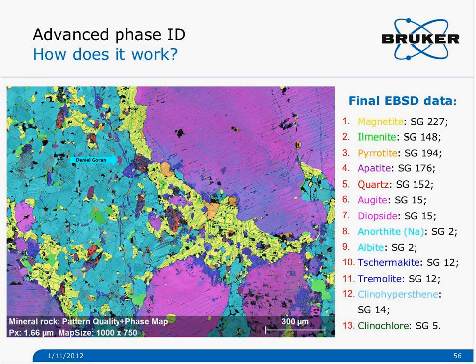And also, it won't be a problem for the software to handle large files. It's also designed to handle this very large map size. And maybe some mineralogists or geologists would like to save the patterns when they have poor patterns, or phases that are very dense and some that are very light.